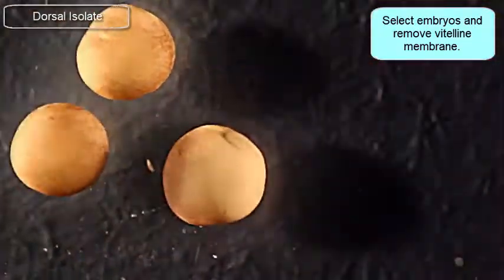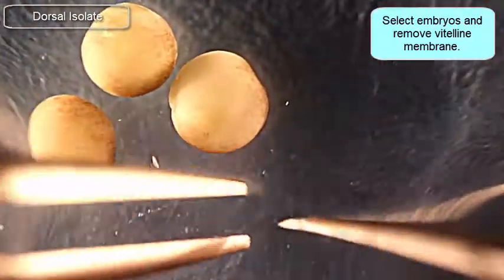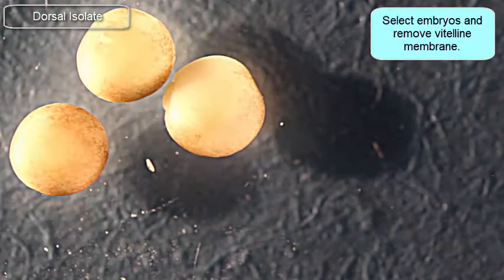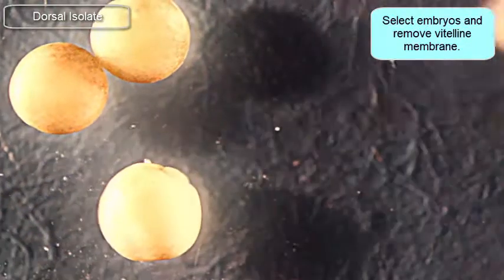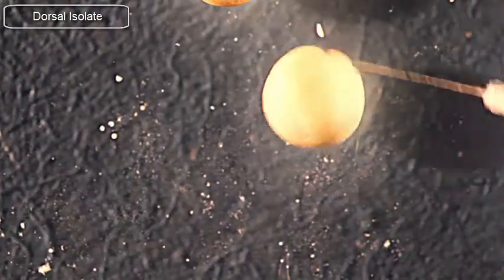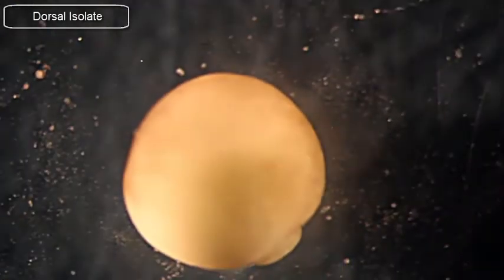I've removed the vitelline membranes. Note the blunt forceps on the left and the pointy forceps on the right. At this point, I want to bring in my hair loop and my eyebrow knife — my hair knife on the right-hand side. I want to focus on rolling the embryo so that the dorsal side is up.